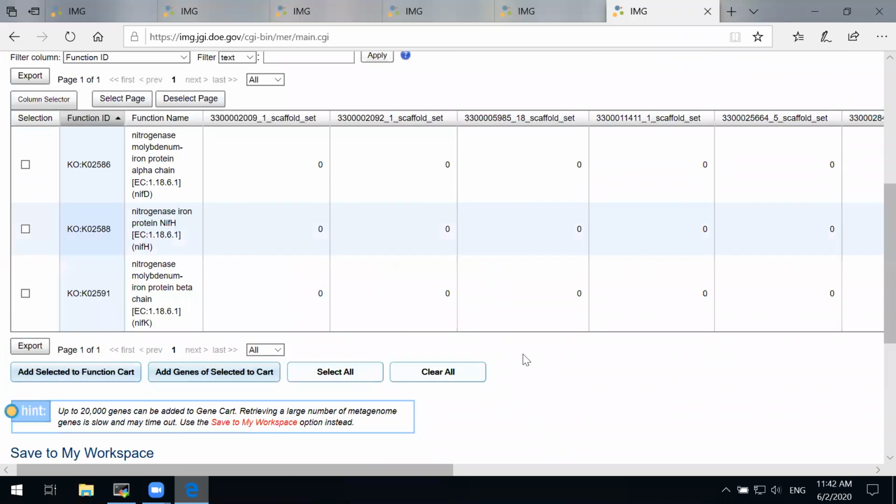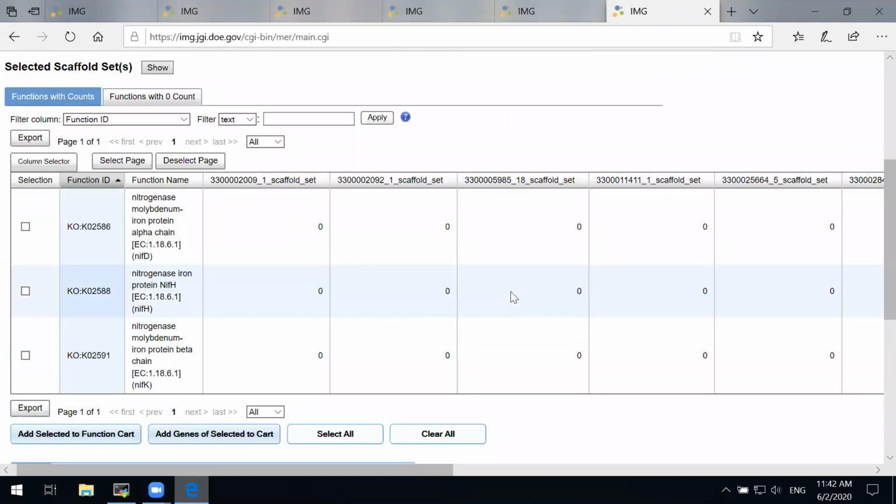So, this completes the exercise of the answer to question number 2. Do the metagenome bins used as environmental representatives of Bradyrhizobium have the nodulation and nitrogen fixation genes the same way nearly all type strains of Bradyrhizobium have? And the answer is no. Actually, none of them, for some reason, have any nodulation genes, and very few of them actually have nitrogen fixation genes as well. So this concludes the second part of the live demo.